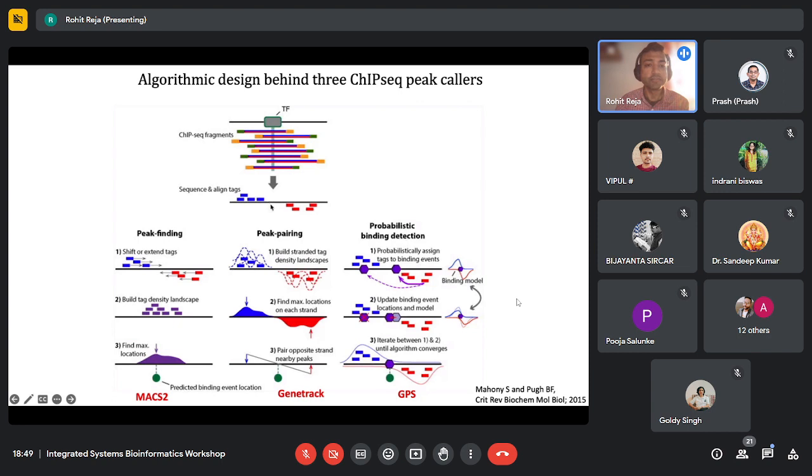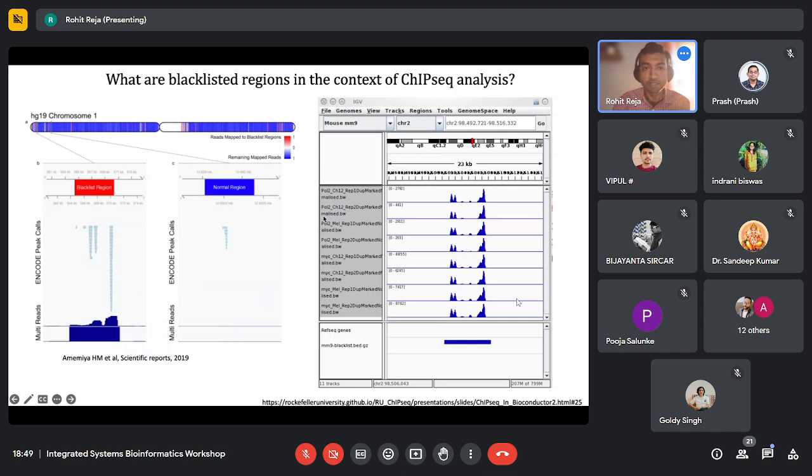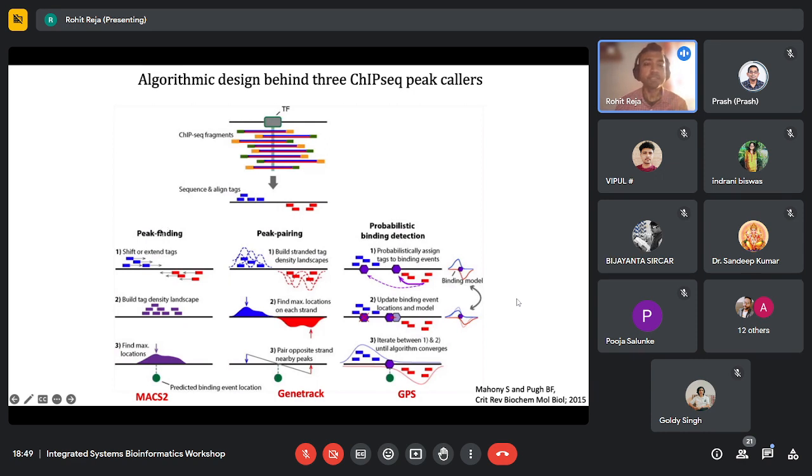So this is where the transcription factor was bound, and obviously this region will be saved from sonication. So you'll get these fragments that are around the transcription factor site. So the peak finding step is intuitively trying to find that midpoint through different approaches and moving those reads to this particular midpoint. So you can say, okay, this is where the transcription factor was bound to the DNA.